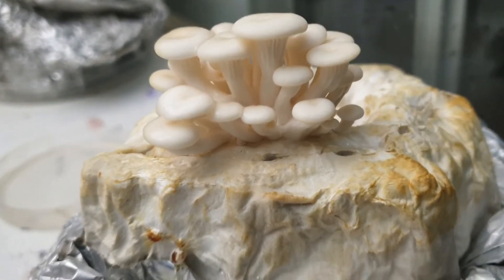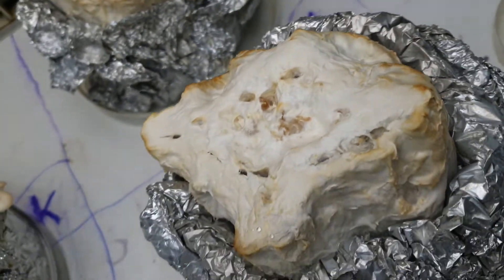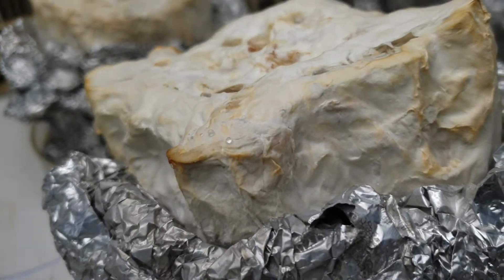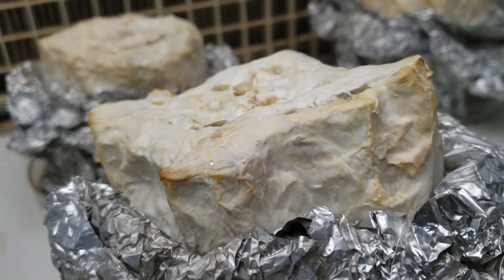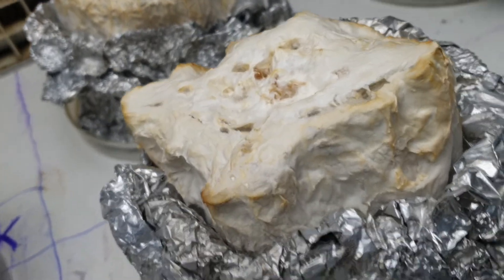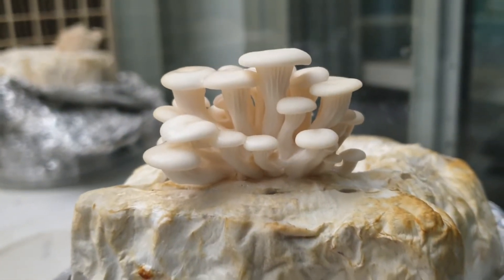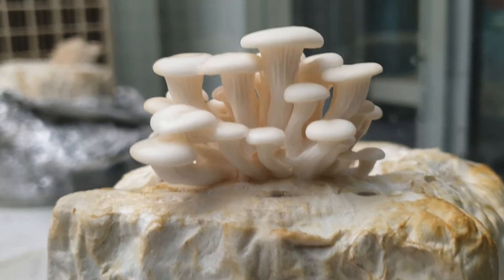After that, we ensure that full colonization takes place. The Pleurotus mycelia ramifies the full tissue paper roll, and after giving short sprays of water, we will get these mushroom fruiting bodies.